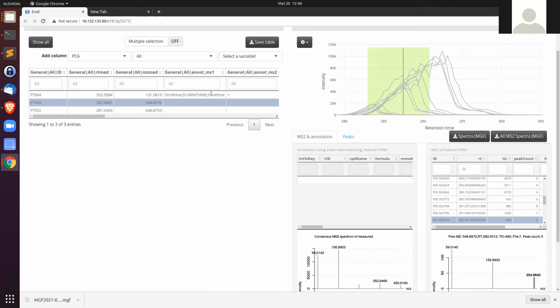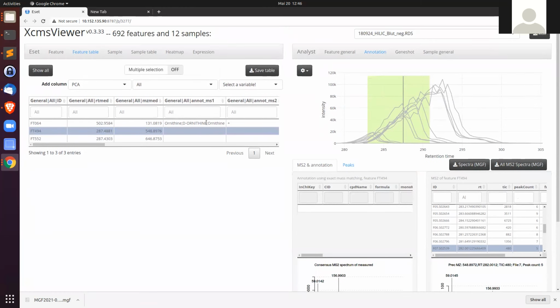So that's why we don't want to exclude those metabolites that are not annotated at the beginning, because they may carry some very interesting biology. Just because we don't know them doesn't mean they're not interesting. But on the other hand, even if there is an annotation on the MS1, according to the mass, it doesn't mean it is a correct annotation.